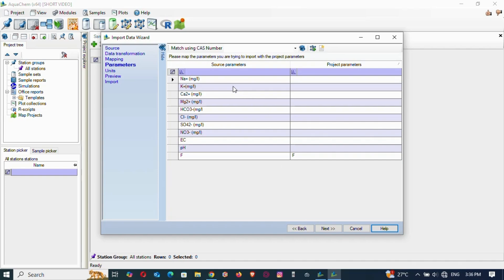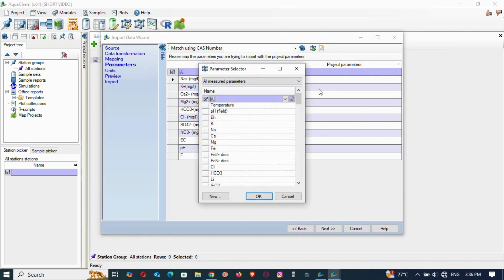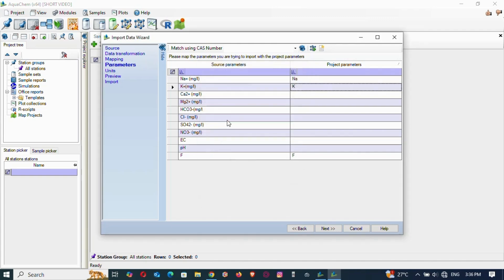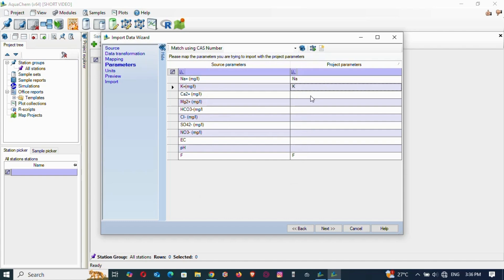Now you are going to match the data. You see sodium here — it doesn't have the ion charges on it. Find sodium on the right side and double-click it to match. Then find potassium and double-click it. This is how the matching works.